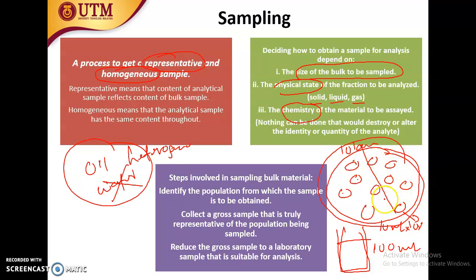Who decides 10? You have to go back to the ASTM, APHA, or AOAC. They will tell you which one is the standard one.